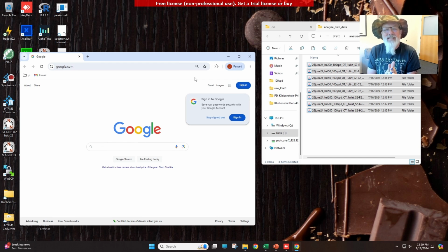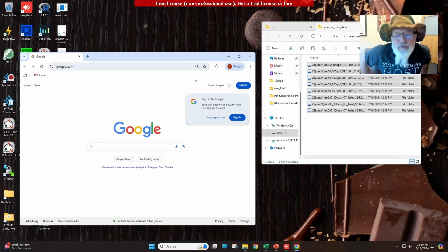It's been a while since I have updated some of the free software tools you can use to analyze your own data. So I thought I'd make a new one because several new tools have come out at ASMS this year, which is the main mass spec conference, about a month ago. So instead of making one terribly long 5-hour video, which I tend to do, I think I'll break it up into several videos.